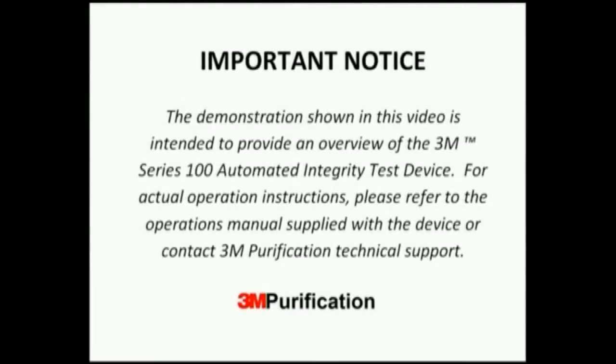The demonstration shown in this video is intended to provide an overview of the 3M Series 100 automated integrity test device. For actual operation instructions, please refer to the operations manual supplied with the device or contact 3M Purification Technical Support.